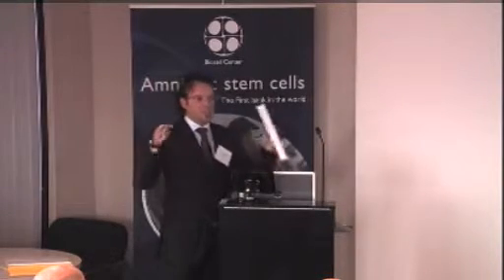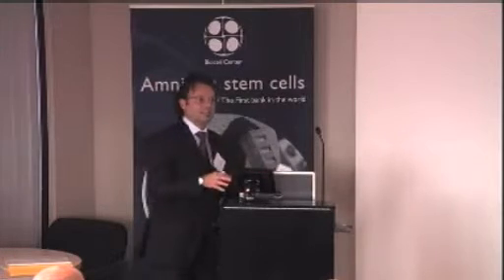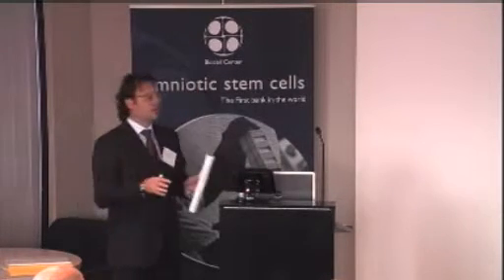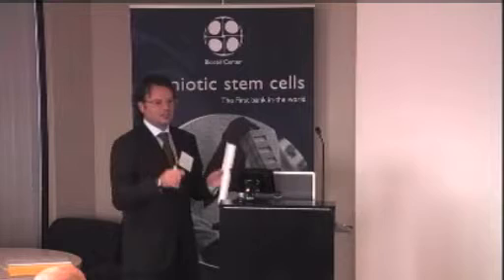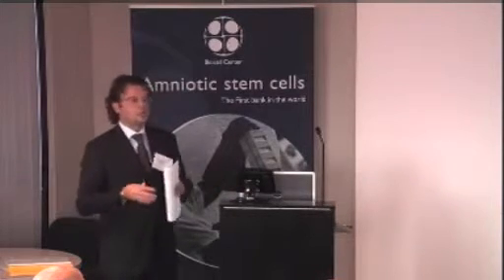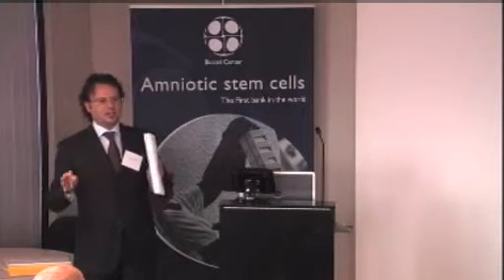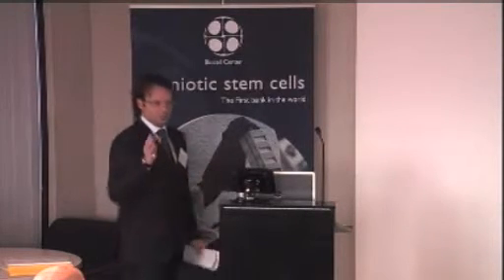The environment inside the isolator is decontaminated, and the air can enter the isolator only through microbial retentive filters. Therefore, if you want to put material into the isolator or take material out of it, you should use a special airlock that has to be decontaminated, or a rapid transfer port.